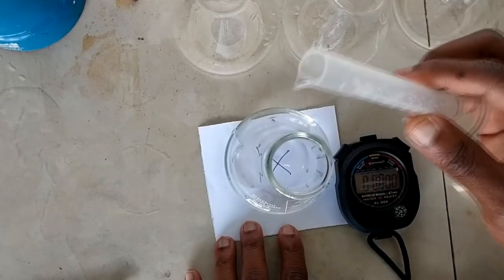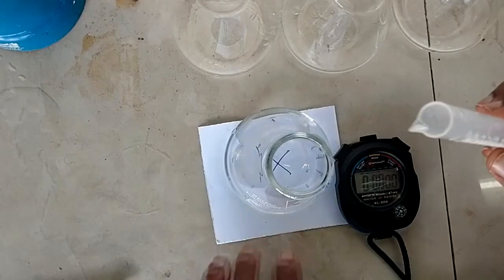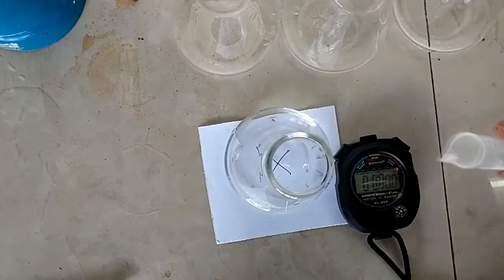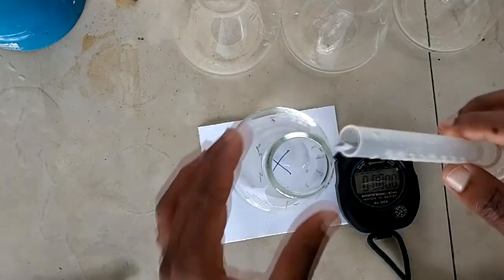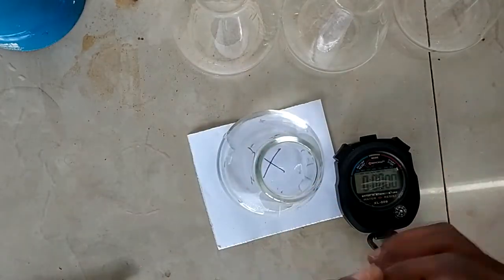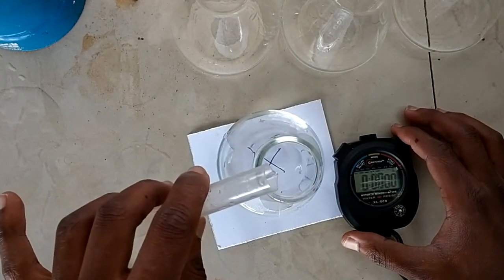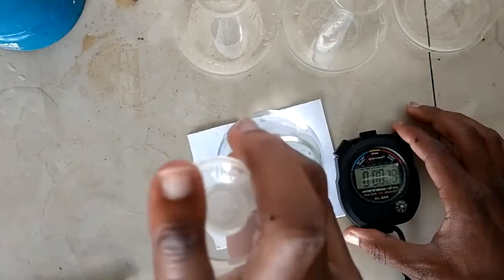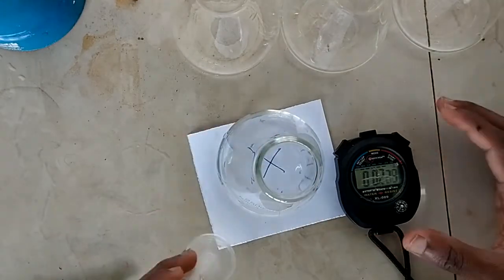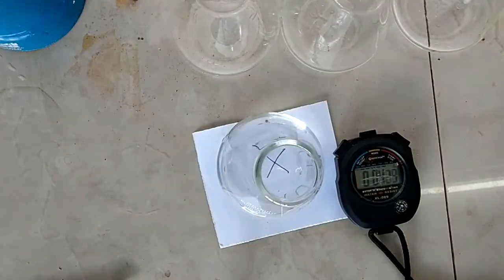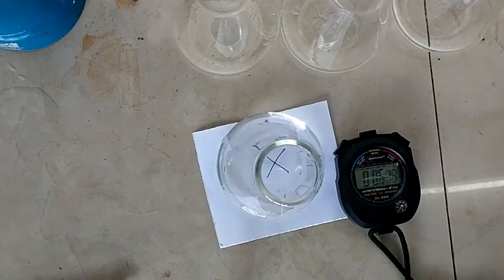So what I'm going to do, I'm going to add the HCl, the two cubic centimeters, swirl the mixture and place it onto the X, and immediately I should start the stopwatch. So I go there. Good. So you need to measure the time it will take for the X to disappear completely when it is viewed from the top.